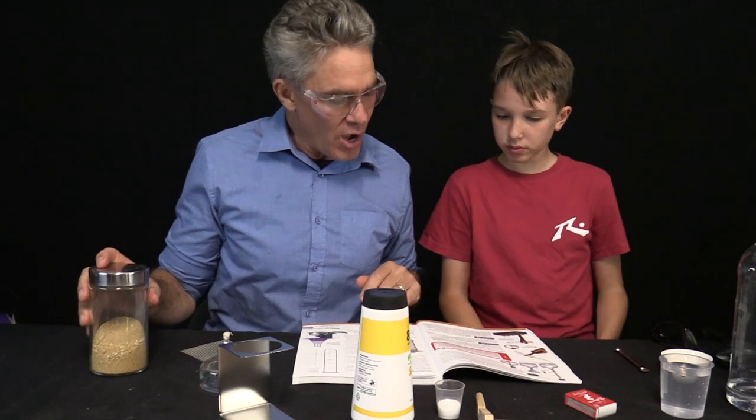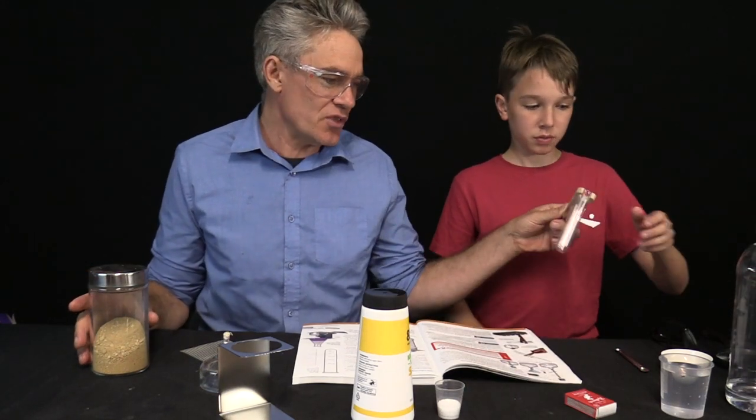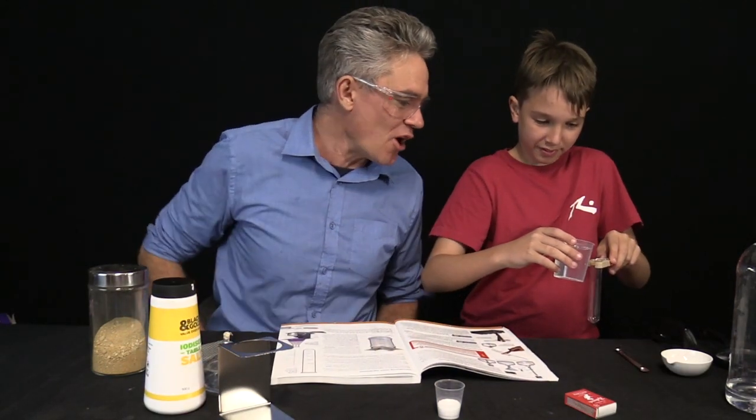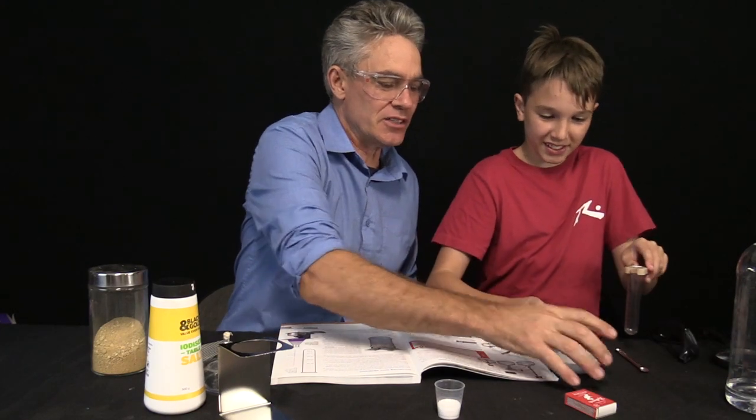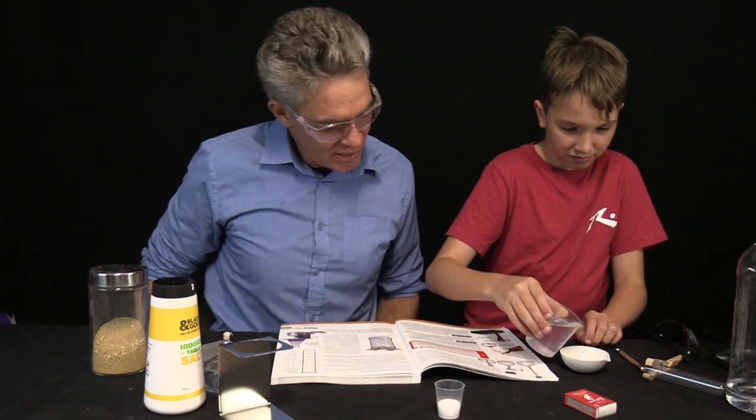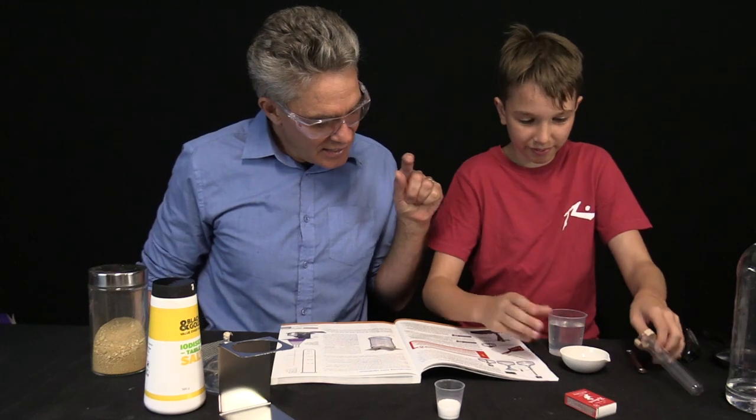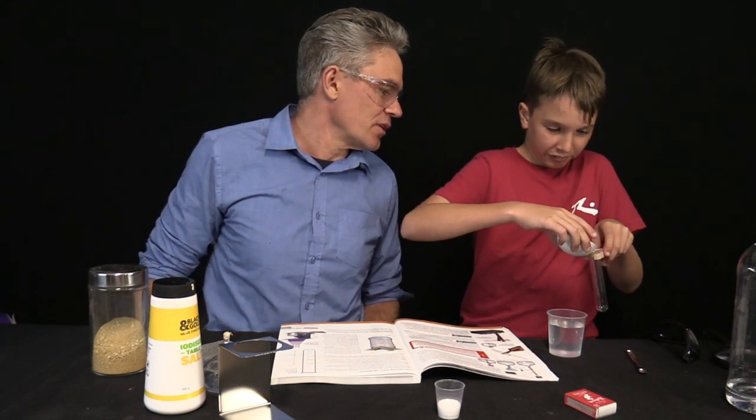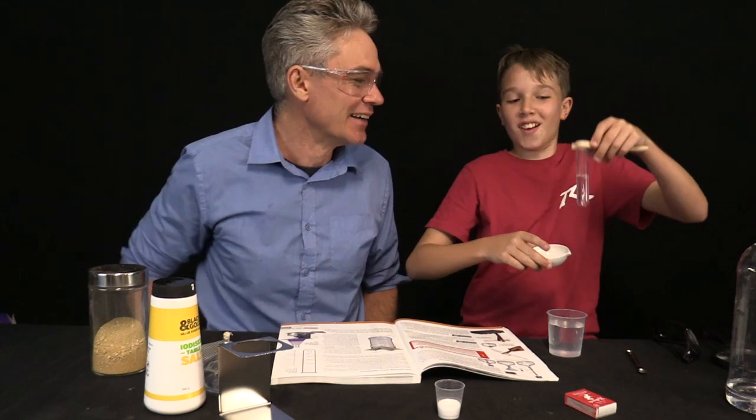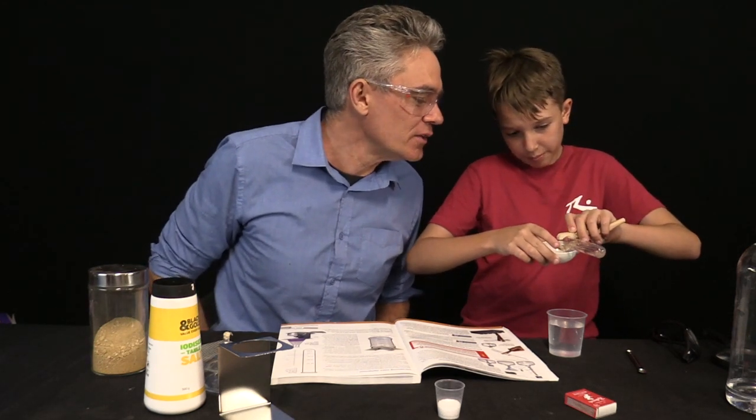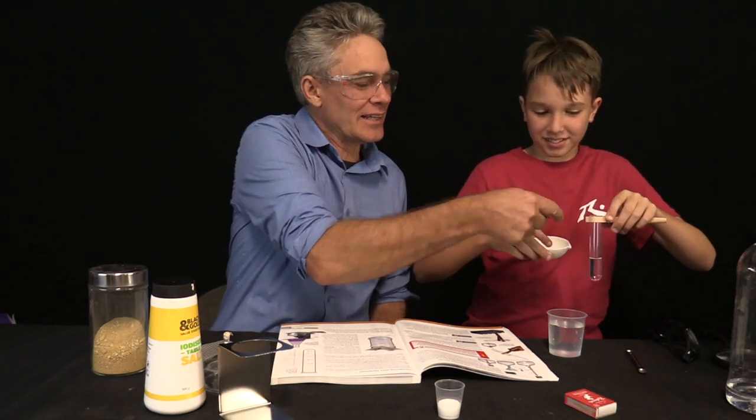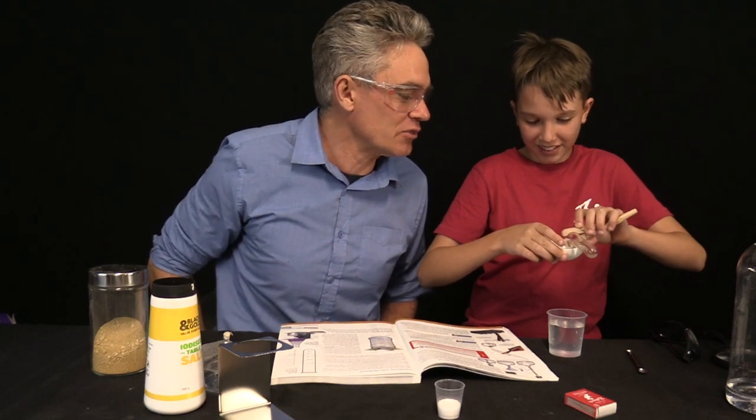The first thing it says is put about five mil of water into this test tube. So Sam's got the test tube and he's going to put about five mil of water. Maybe transfer it to the evaporating dish so that you've got a little nozzle. You need to pour in about two centimeters into the test tube. That's about five centimeters, that's a bit too much. That's about two centimeters or five mil.